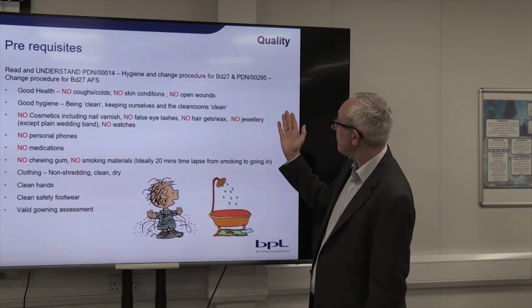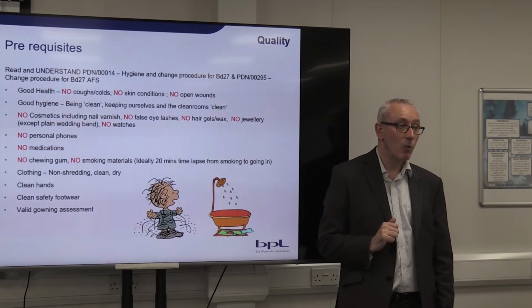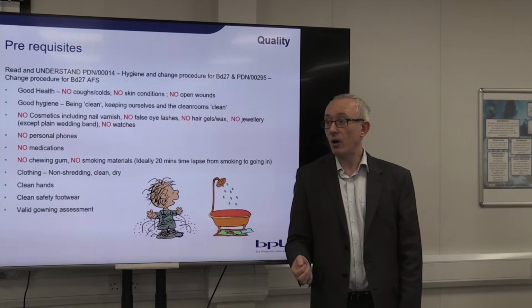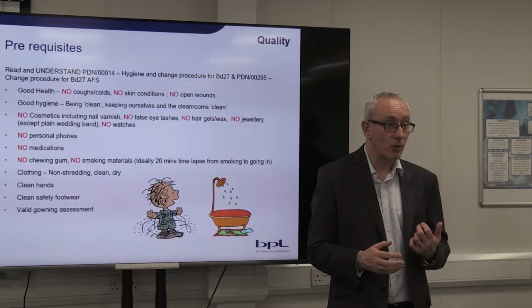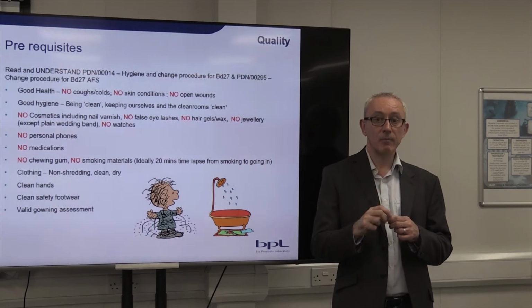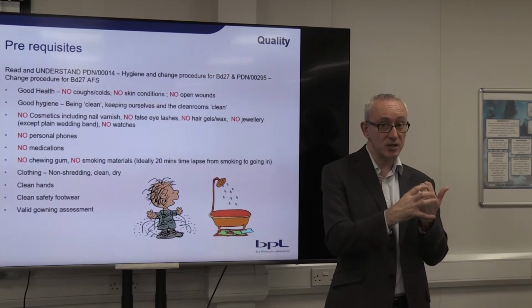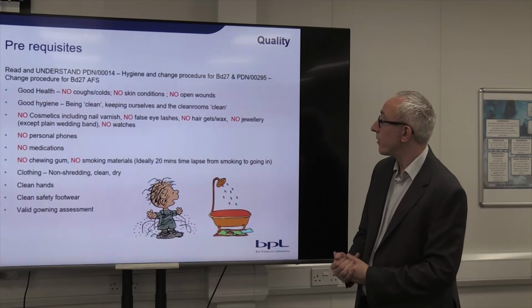There's also no jewellery permitted apart from the plain wedding band. And we did have an incident only a couple of weeks ago when somebody wore a ring into a clean room that had a stone in it, and that tore the glove very quickly, and then the operator's exposed skin was there, and that presented a risk to the product.